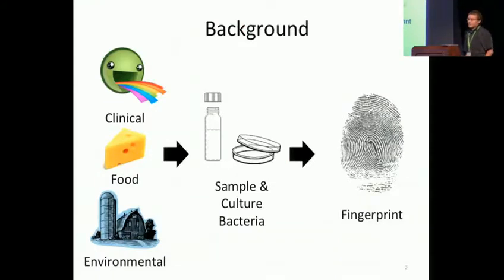Okay, so at our lab, we deal with quite a lot of different sorts of data, but the one particular area that I'm involved in a bit is outbreak detection, response, and investigation. In particular, we're focused on bacterial pathogens, in particular foodborne bacterial pathogens.